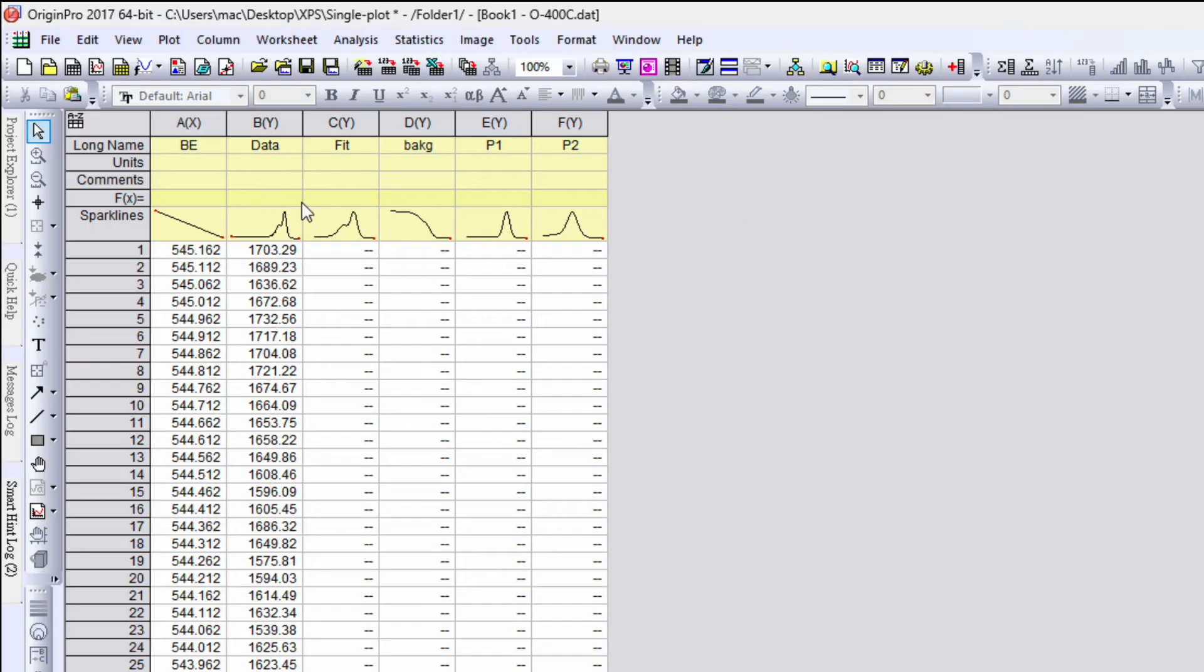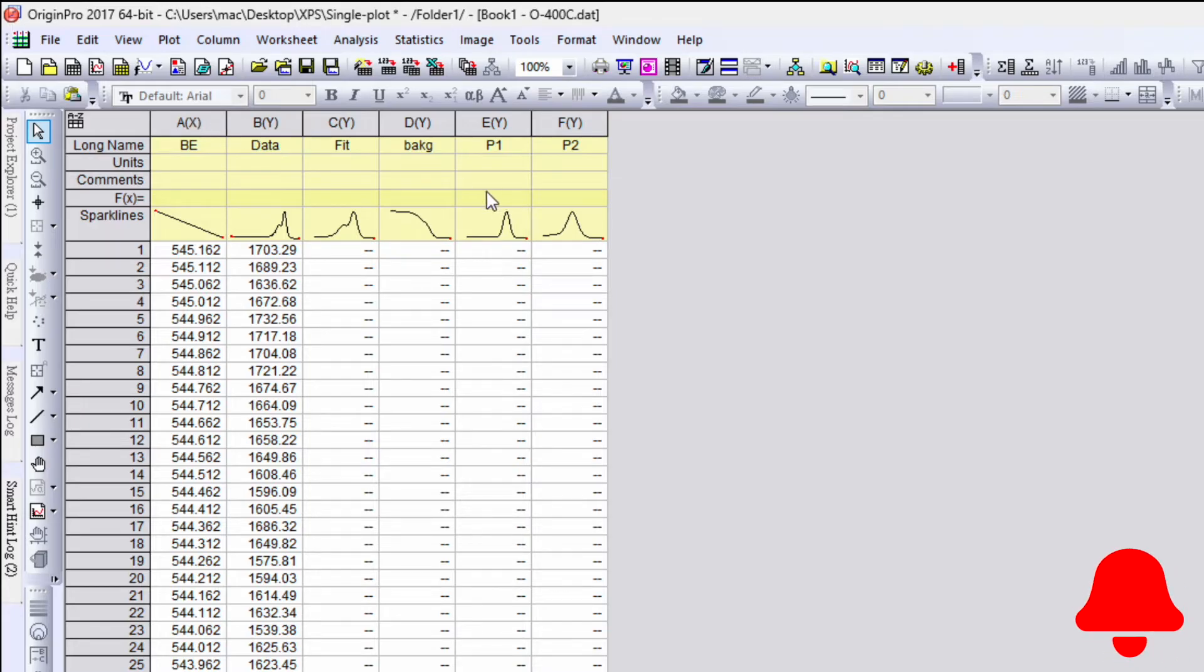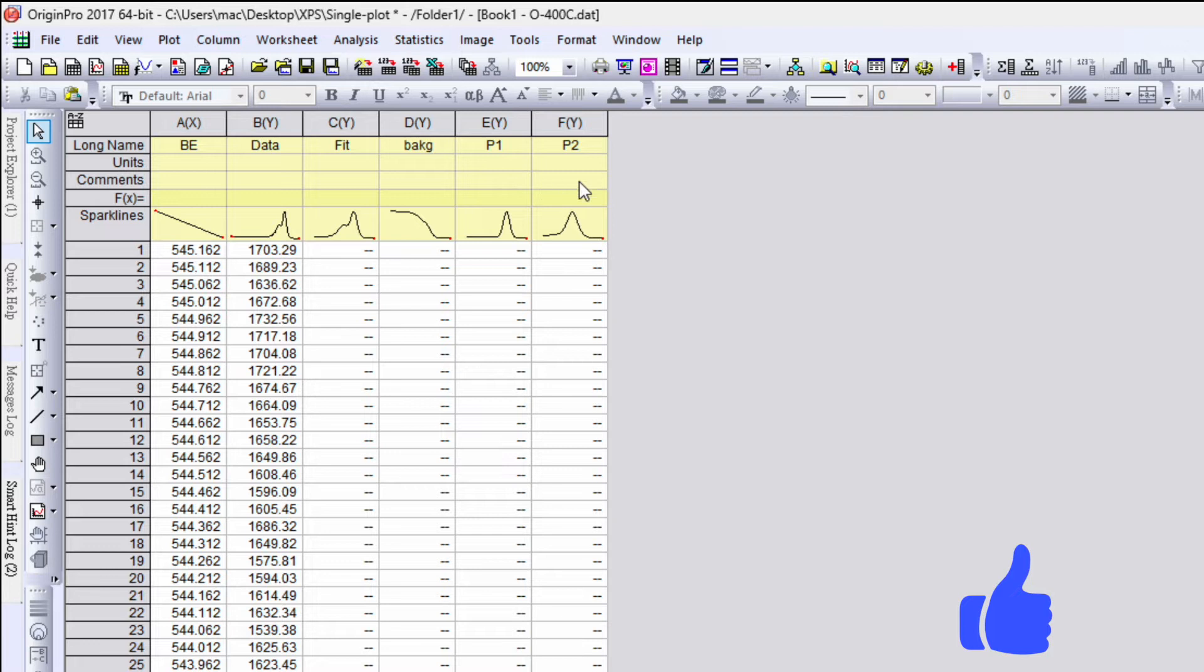Now go to the exponential data. So we have x-axis as binding energy, y-axis as exponential data, then the fitting curve, background, peak P1 and P2.